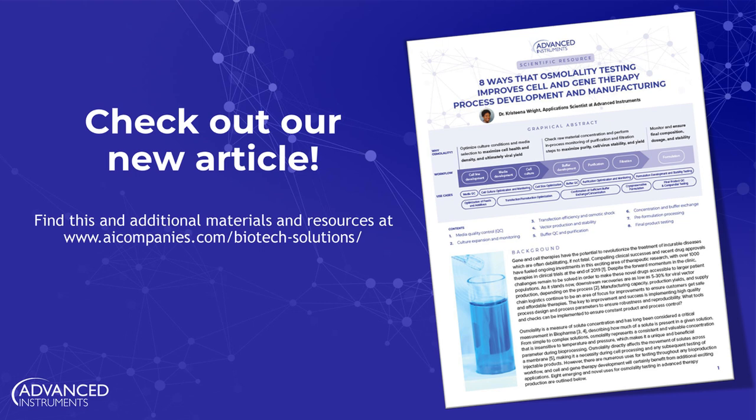Thank you, Christina. Another question we have is what's the suggested target osmolality value for upstream transfection to improve the productivity? Great question. So I guess it's not a simple answer. I would say that it depends on the type of transfection. So I'd be curious to learn a little bit more about your specific methods. I know that our first participant had asked about PEI Pro specifically. So it may be a little bit different.